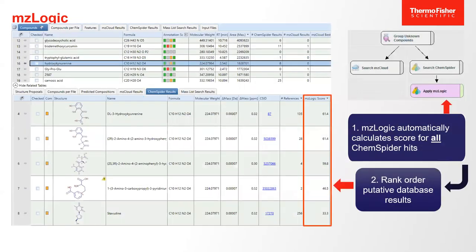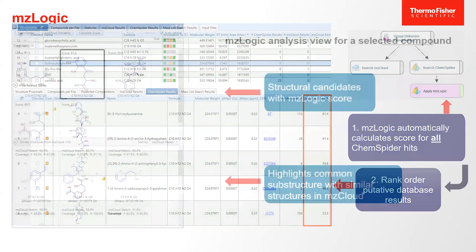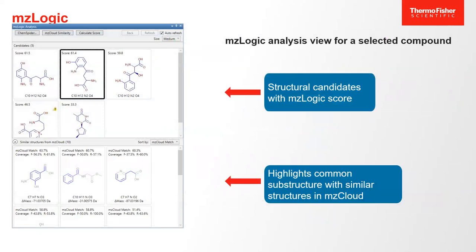Okay, so in the end, we're going to get a much smaller subset and we're going to get a quality score. In this case, you can see we're really down to three compounds that are pretty similar in their score and pretty similar in their structures. Just by moving a little side piece around, pretty tough. And it shows you the common structures that it was based off of with literature references to see if that helps you.